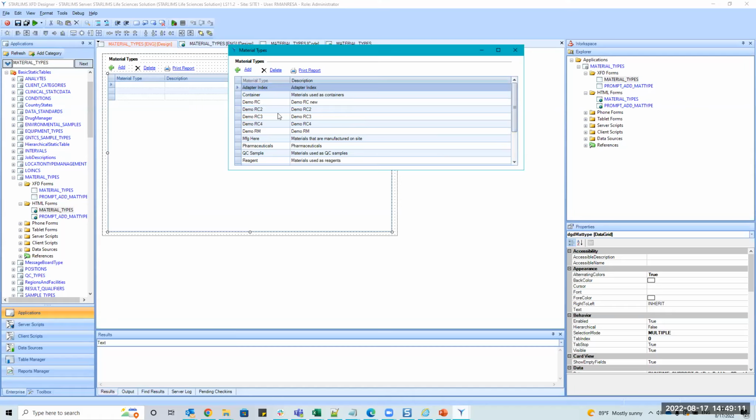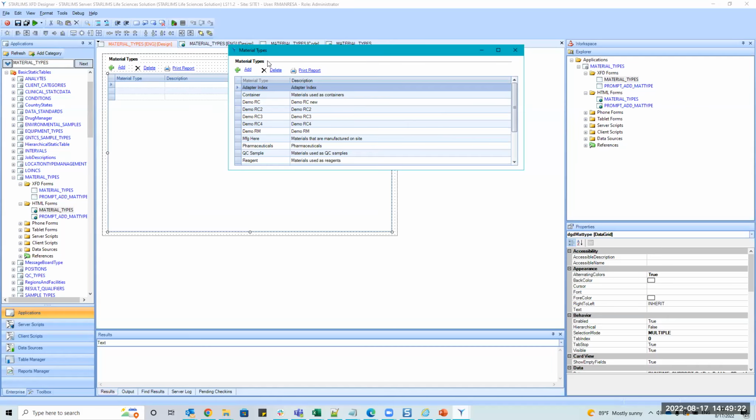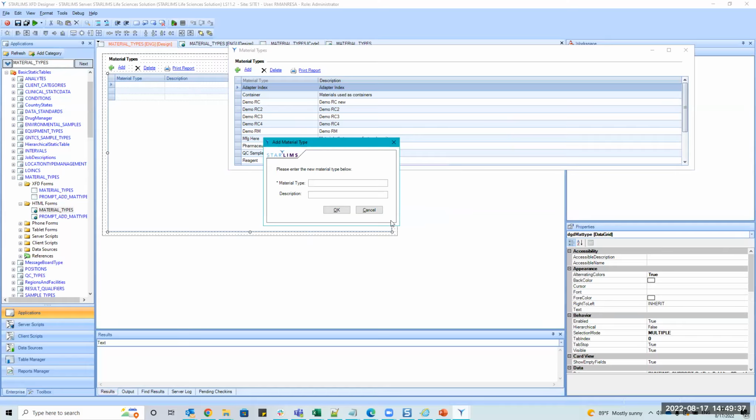In order to have this, because again, you have different screen resolutions, whether it's maximized, right? You see it kind of expands. The same with this line here. Believe it or not, this is just another control. It's called the line. And if you do this and the line doesn't move and it stays, it's just visually not nice. The same could happen here. This one I cannot move, but let's say this pop-up happens and you start dragging it here, then your add and cancel should move accordingly, right?